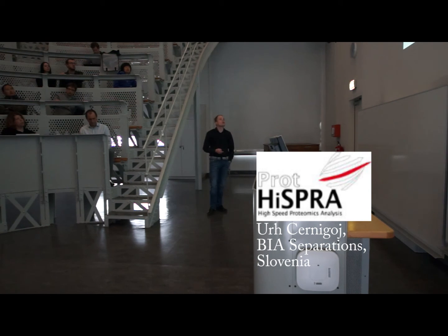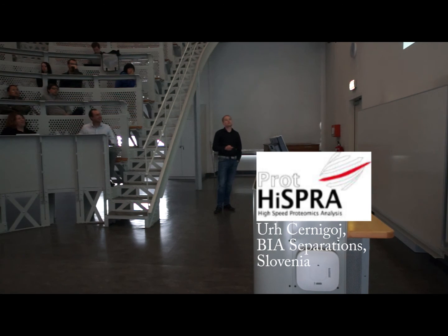Just to summarize, we bound the titanium dioxide. According to the literature, nobody has bound nanoparticles to monolithic material, organic monoliths, so far, so obviously this is the first time this has been successfully done. And what is very nice is that it is a very simple and very cheap procedure, so this could be done in a very easy way. And we have proven the selectivity for these phosphorylated peptides.